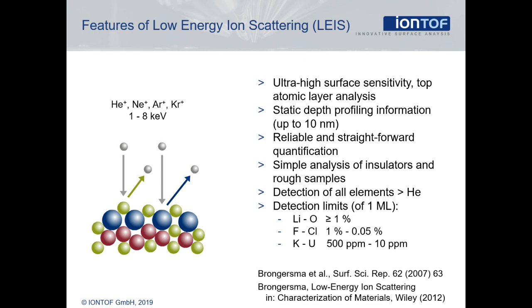However, after transport through air, most samples are covered by 1 to 2 nanometers of adsorbed hydrocarbons. How do we solve this problem? Even if the surface is not contaminated, it ideally has to be in the same chemical state that it is during its application. For heterogeneous catalysts, this state strongly depends on the chemical and physical conditions.